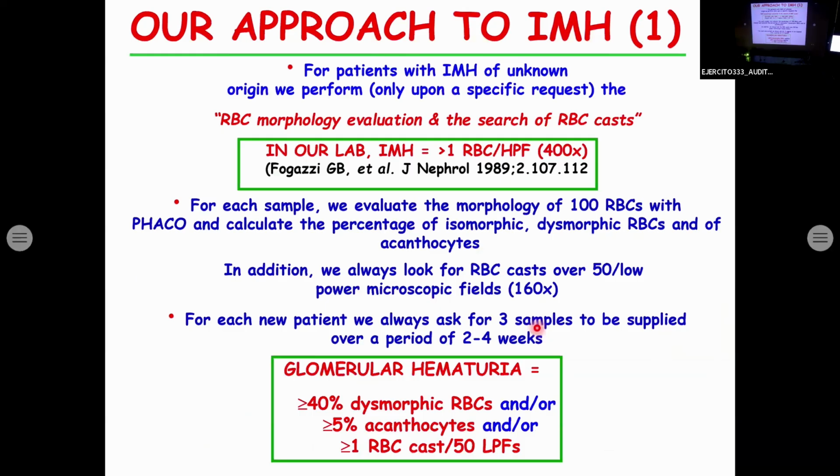And now, what is our approach to isolated microscopic hematuria in our specialized laboratory? I work in a laboratory which we call Clinical and Research Laboratory on Urinary Sediment at Ospedale Maggiore Policlinico in Milano. For patients with isolated microscopic hematuria of unknown origin, we perform, only upon a specific request, the red cell morphology evaluation and the search of red blood cell casts.